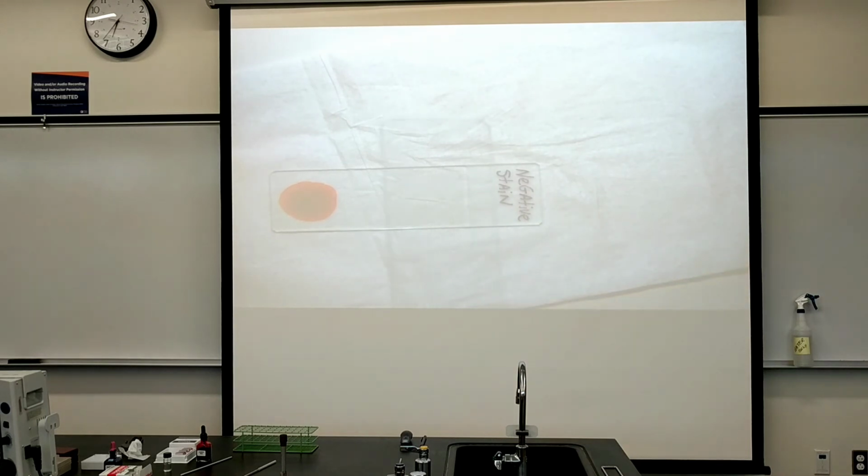That's how a negative stain is made, by taking this second slide. Now notice the second slide carefully. It actually has cut corners. If you look at what's present here, right at the corner edge, you can see that there's a cut-off corner, and it's on both sides. And those cut-off corners, called a bevel edge, make a special slide so that the dye doesn't spread all the way to the edges.